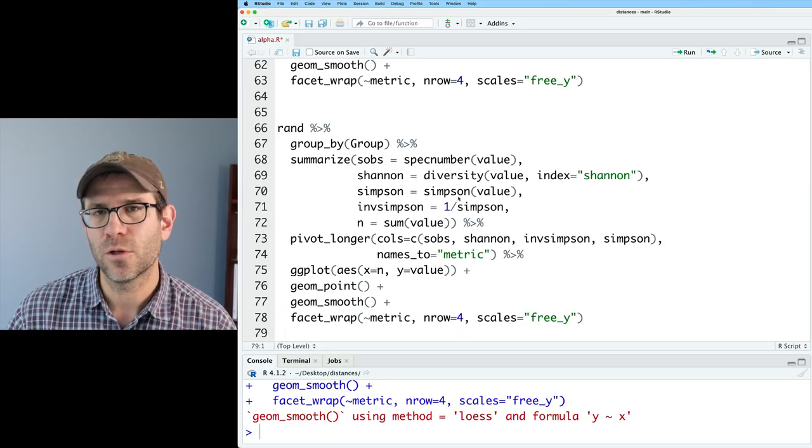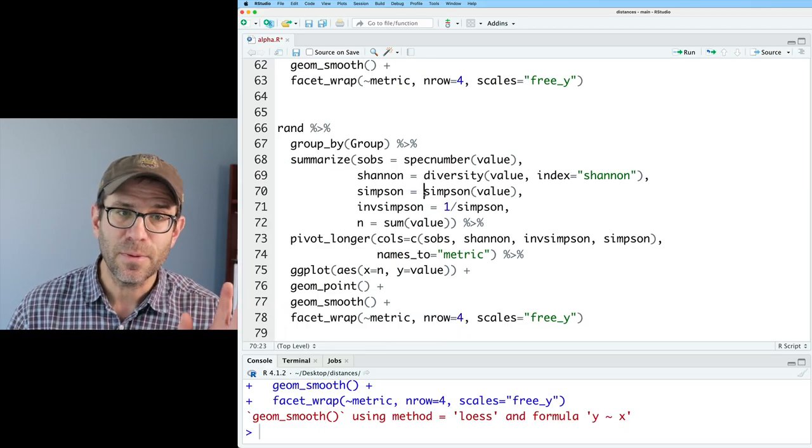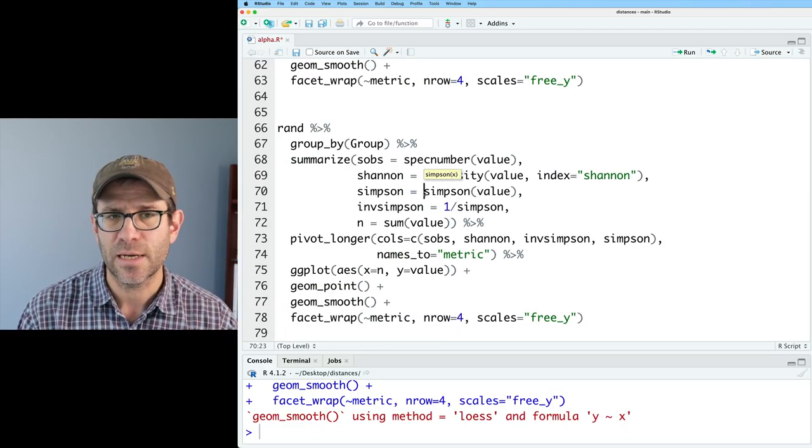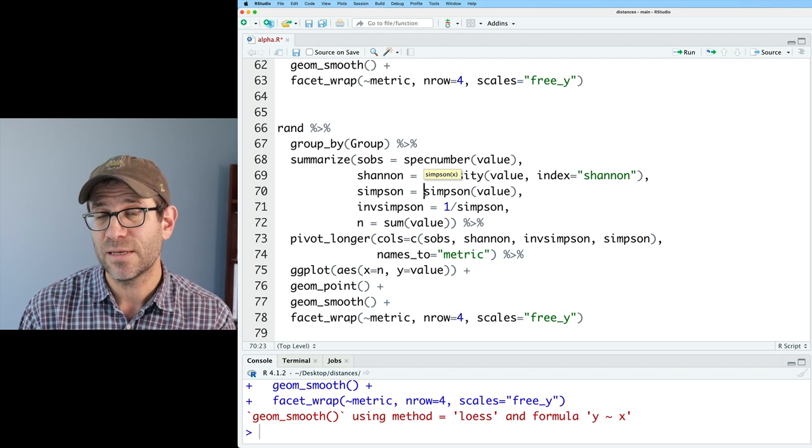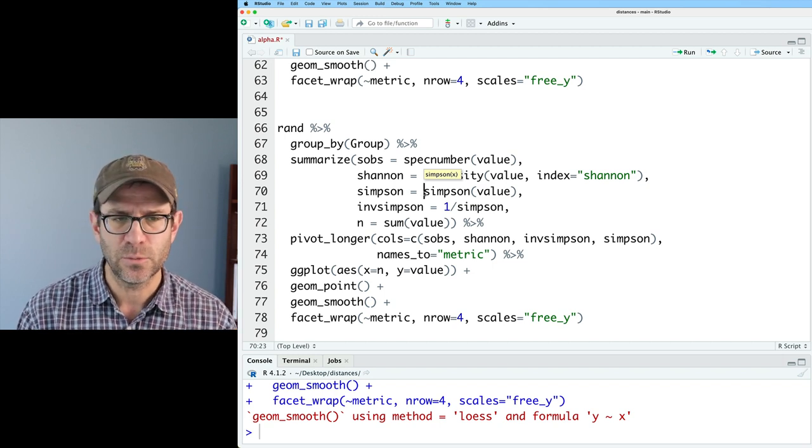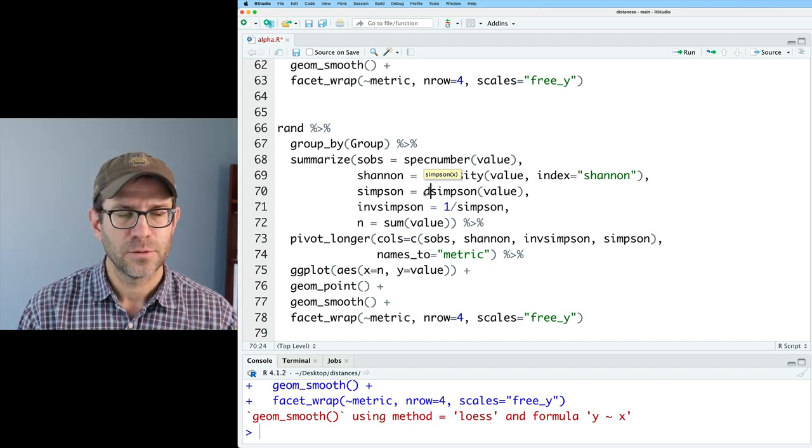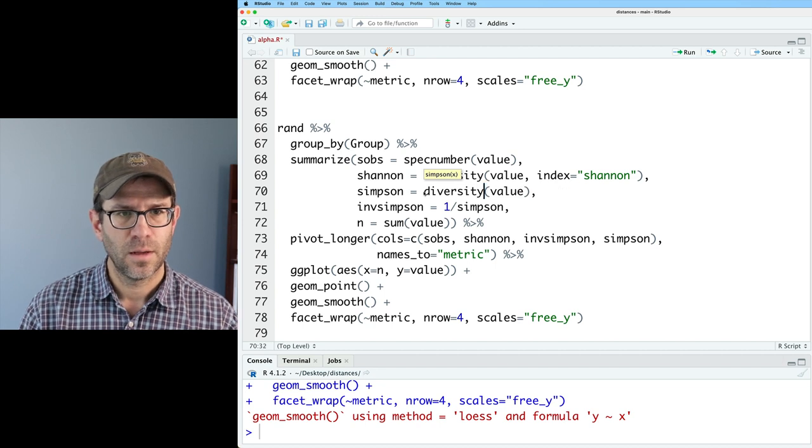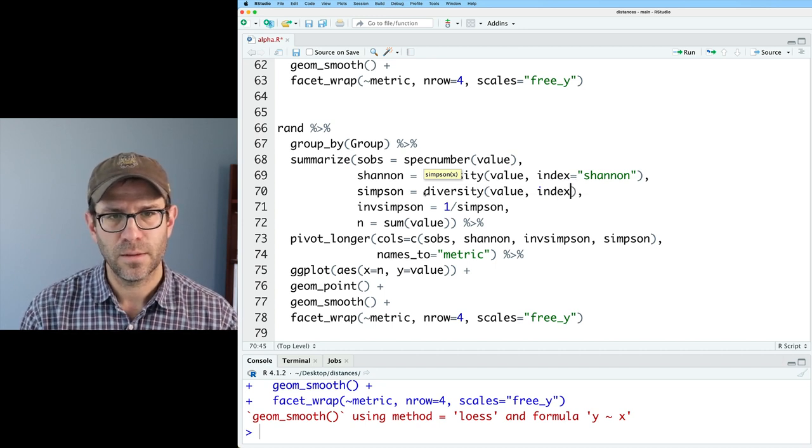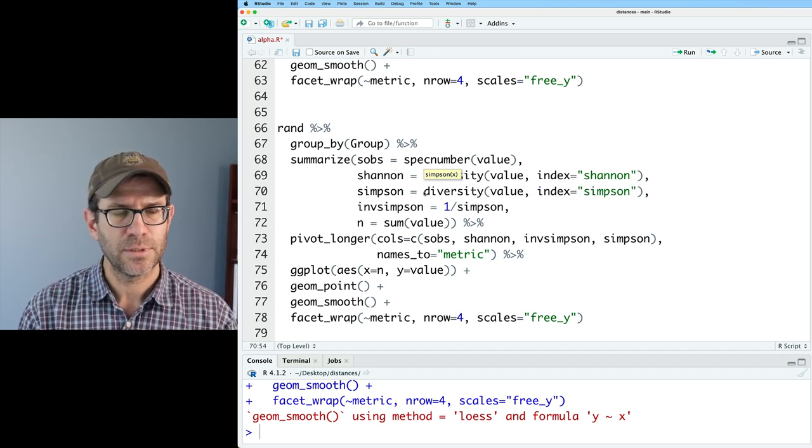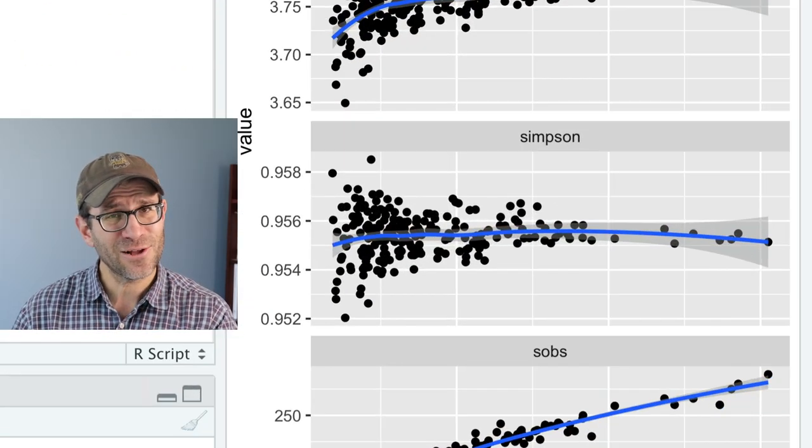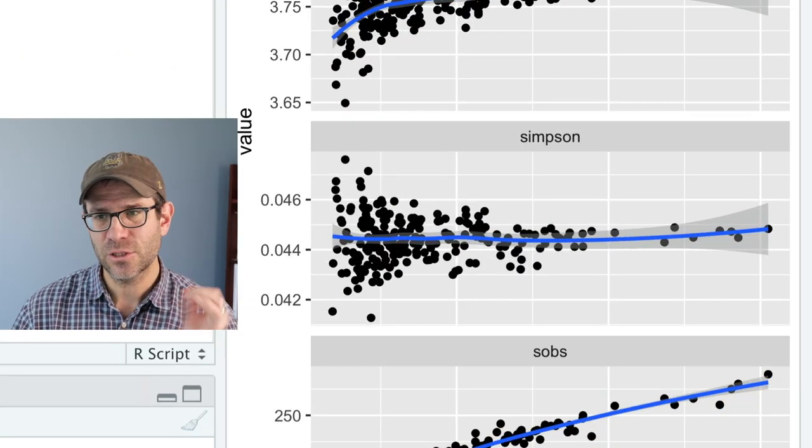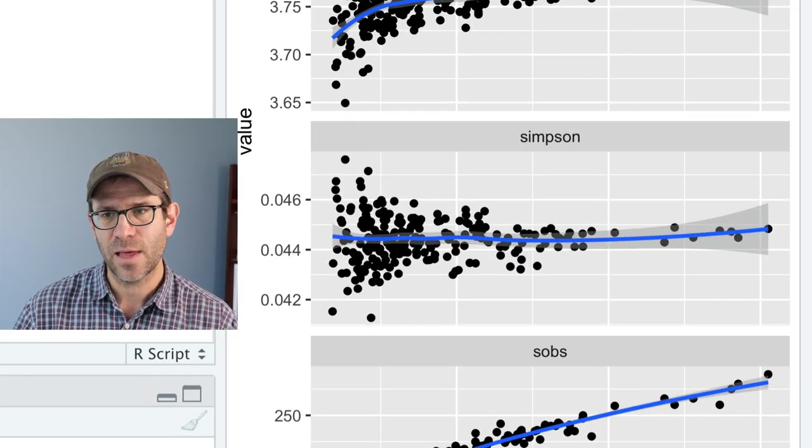Next, we want to look at Simpson. That'll be the same function as we saw with Shannon, except instead of index equals Shannon, we'll use index equals Simpson. So I'll do diversity and then index equals Simpson.